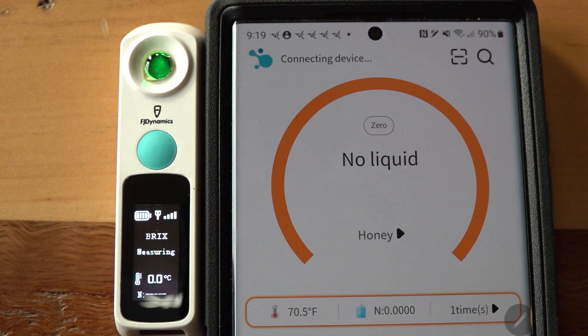I hit the button and that little green light comes on, so it's sensing. Watch — it reads out Brix: 79.90. That means nothing to me when I want to know the water content.